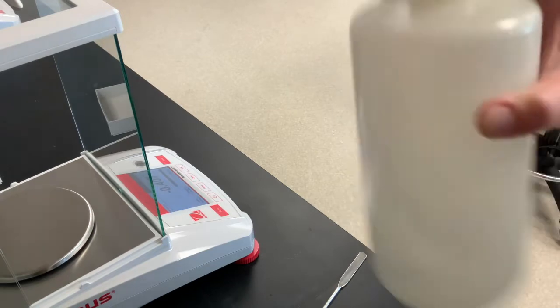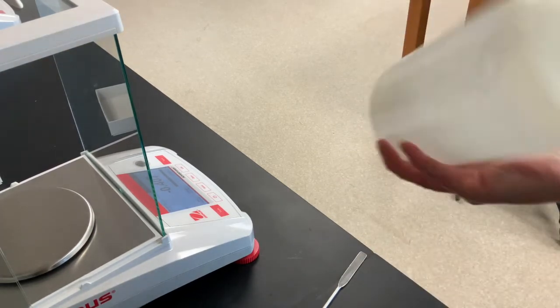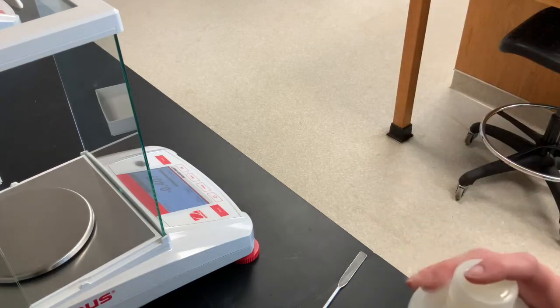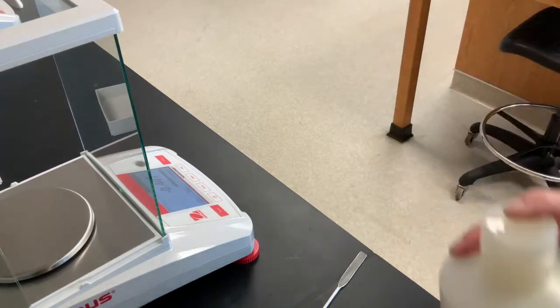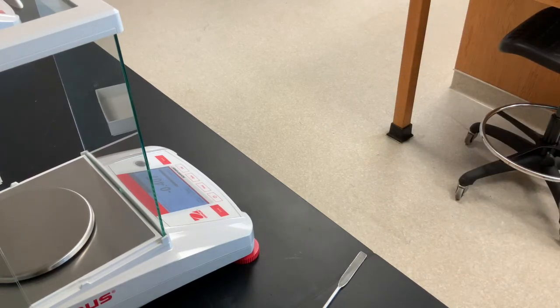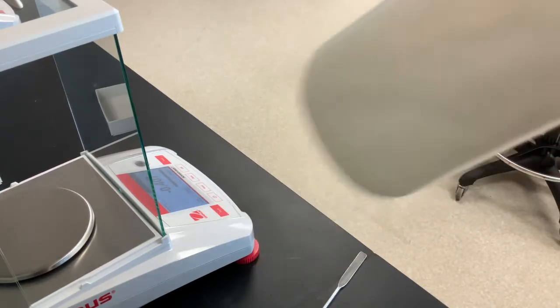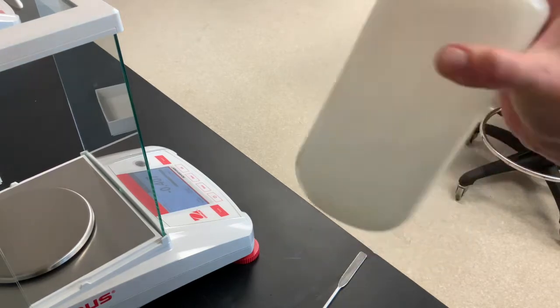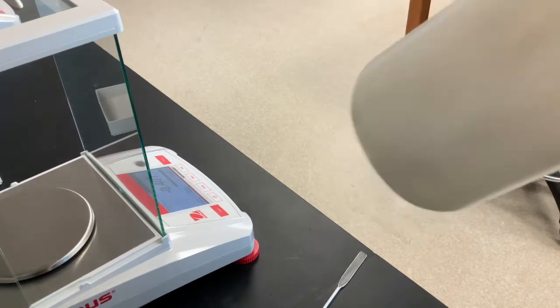Once we've dissolved our sodium hydroxide, we're then going to titrate it with some hydrochloric acid so that we can figure out the exact concentration of sodium hydroxide. Remember that sodium hydroxide is a hygroscopic compound. That means it's going to rapidly absorb water. So just as I was weighing it, it was already absorbing water from the atmosphere. That means we don't know exactly what the molar mass is, because we don't know how much water the sodium hydroxide has absorbed. So we don't know how much water to take into account in the molarity. And so this is why we've got to titrate it, so we know its exact concentration.